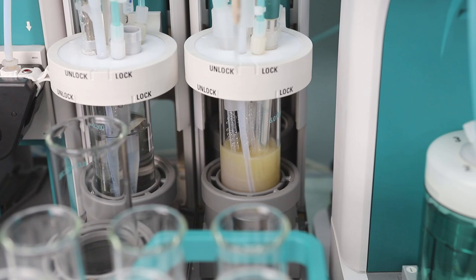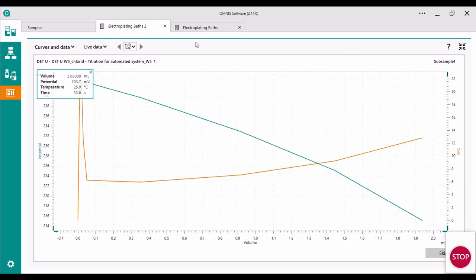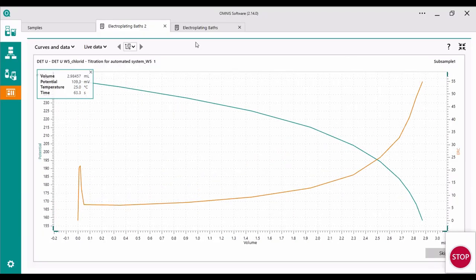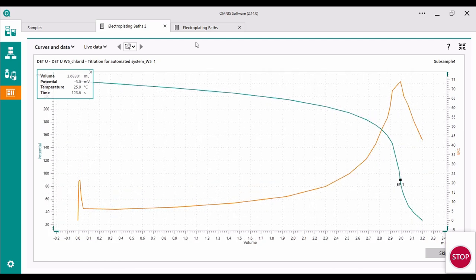After the equivalence point, the color of the solution changes from brownish to pale purple. The third titration is the argentometric chloride determination with the silver titrate and 0.1 molar silver nitrate as the titrant. Nitric acid is added as an auxiliary solution. Directly after the first addition of silver, silver chloride precipitates.